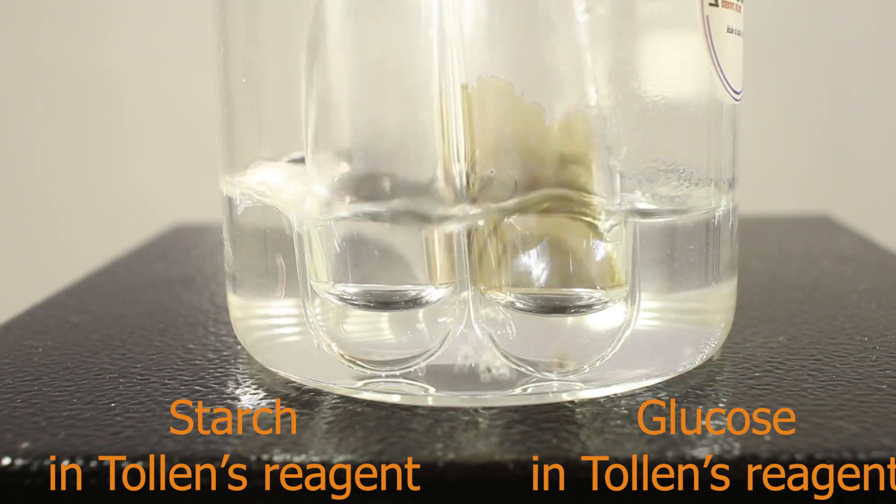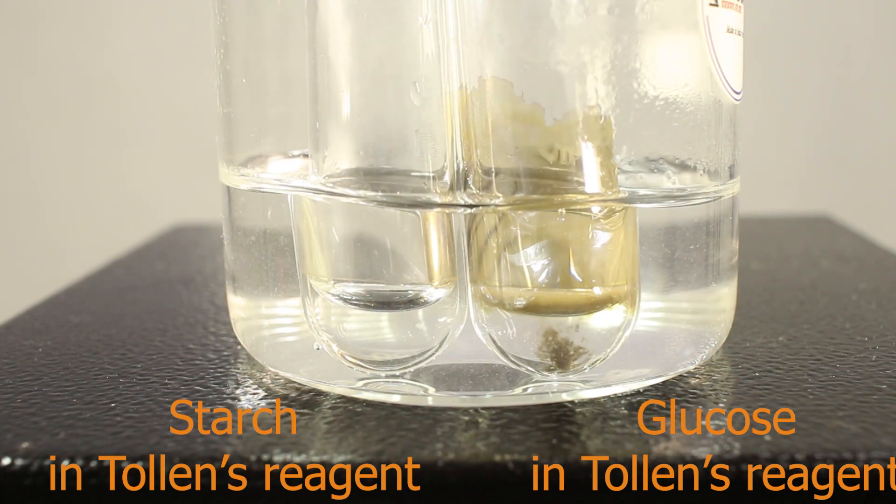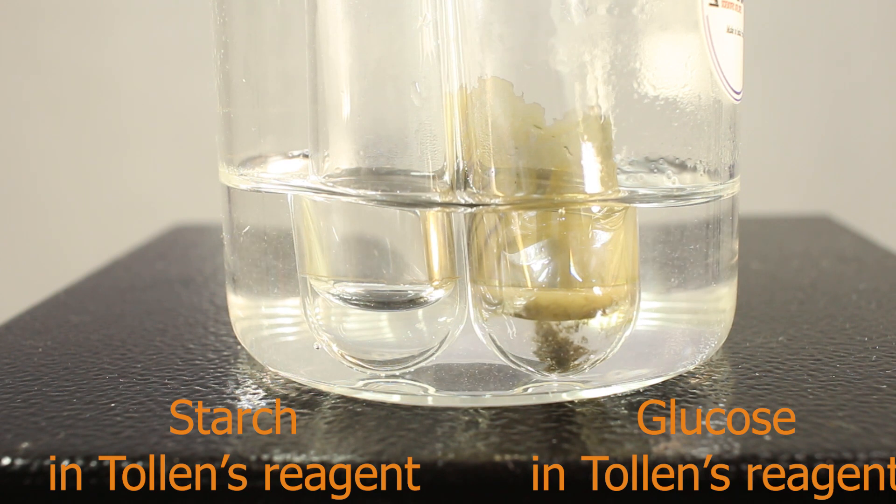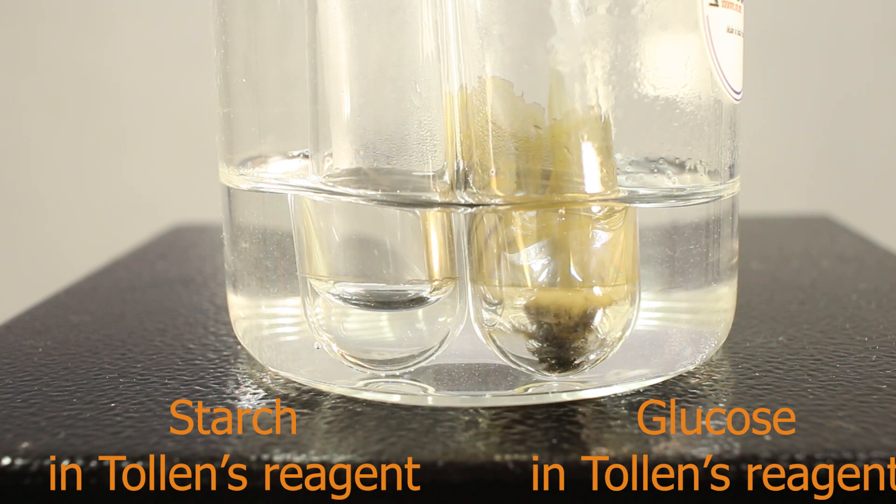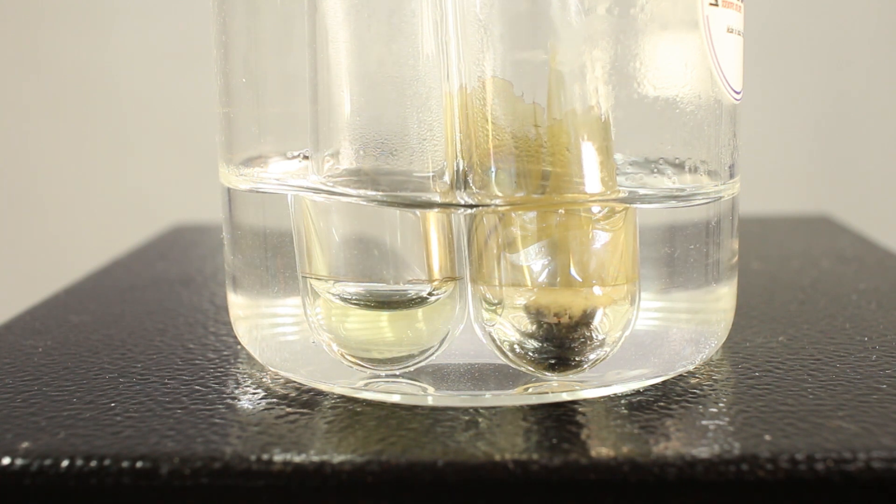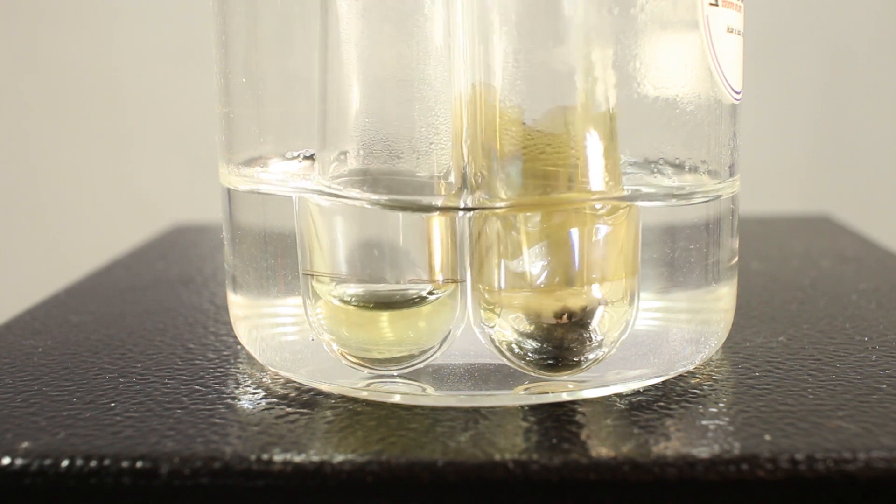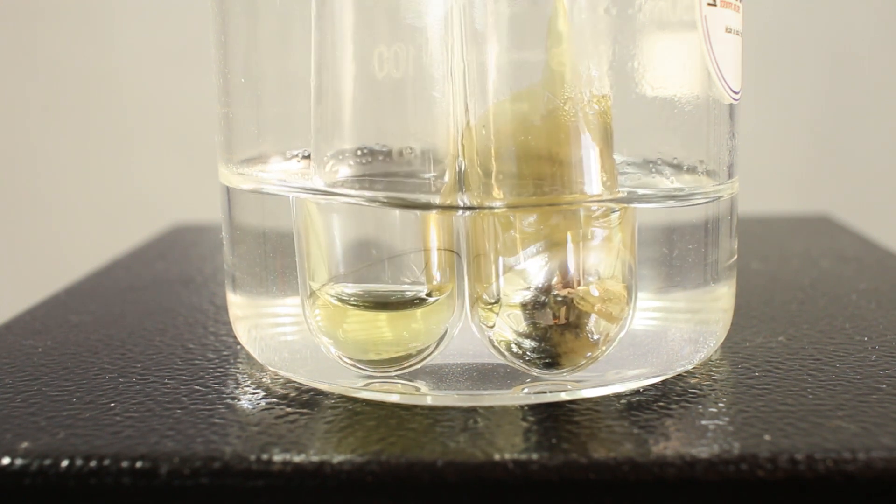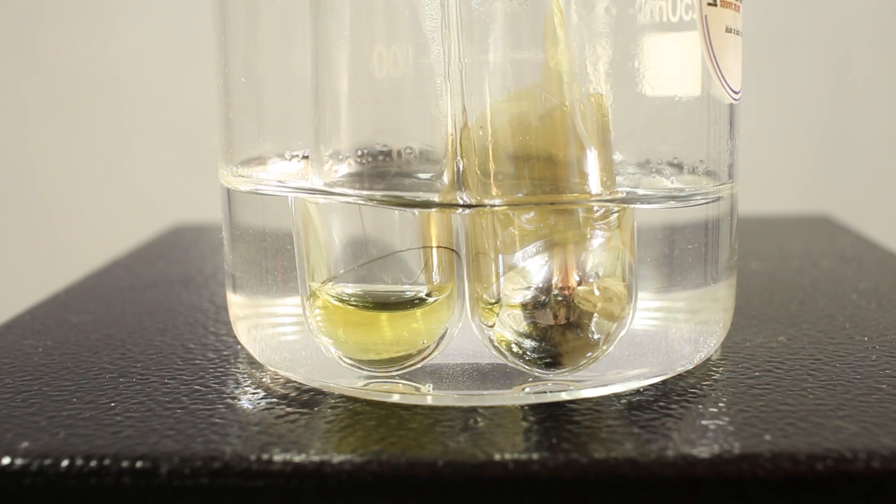Now, glucose reducing silver ions to metallic silver. Grey precipitate is forming, and also some silver forming a layer on the test tube. Obviously, on the right, where you see positive result. Silver mirror is formed. Silver mirror test, Tollens reagent test sometimes is called.